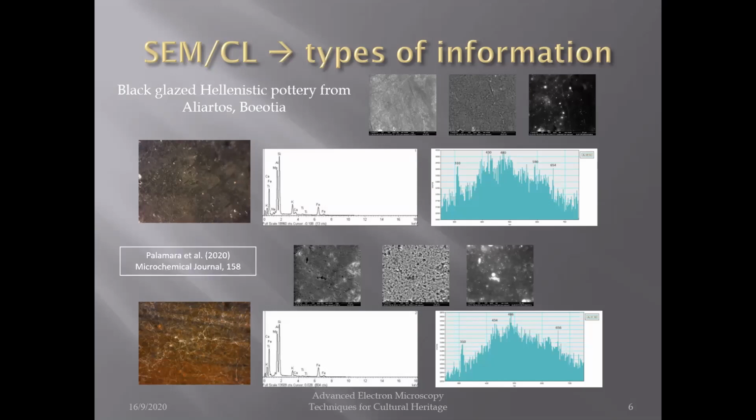In this case, our result was that we could identify between different qualities of glaze based on the CL spectra, even though the elemental analyses were identical.